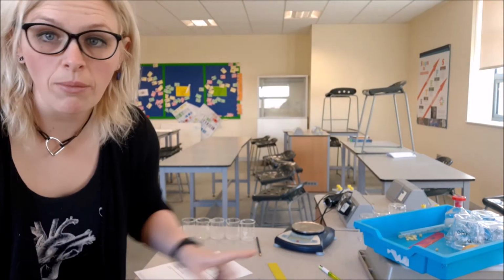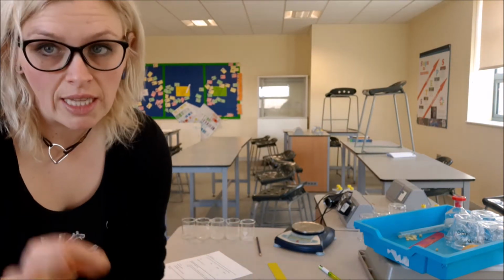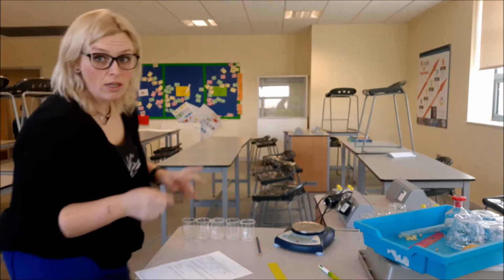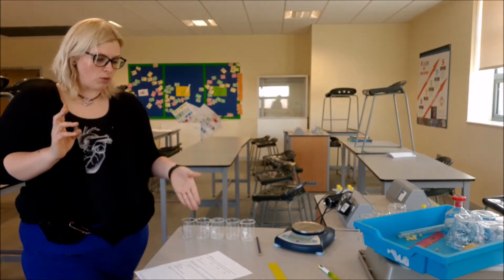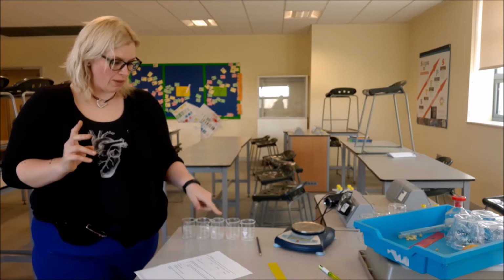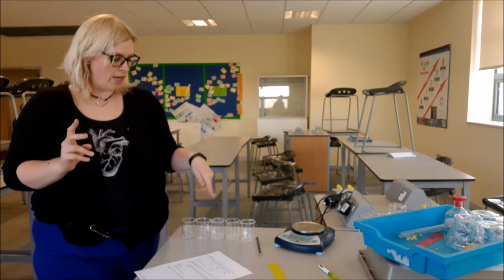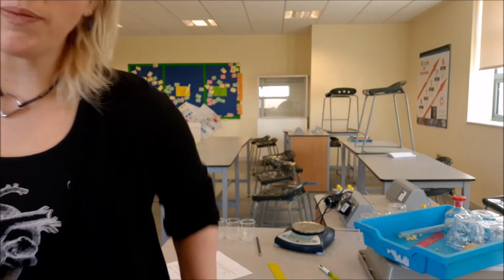When we take the mass of something, we use one of these. Ooh, one of these. This isn't called a scale, it's called a balance. That's the correct apparatus. So what I'm going to do is quickly take the mass of all of the potatoes and take the length of all the potatoes, and then I'm going to put them into the beakers depending on what concentration of liquid I'm going to use. Okay, so I'm just going to put all of them into the beakers, then I'm going to add the solutions.